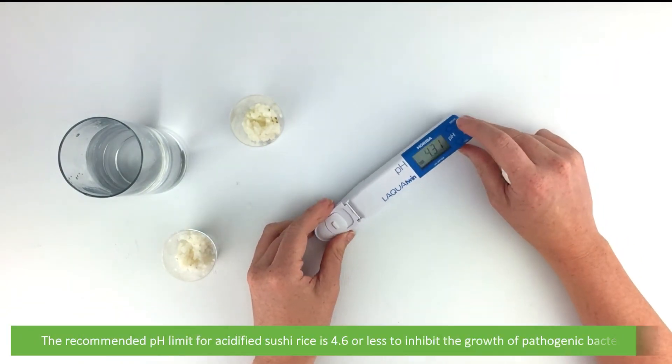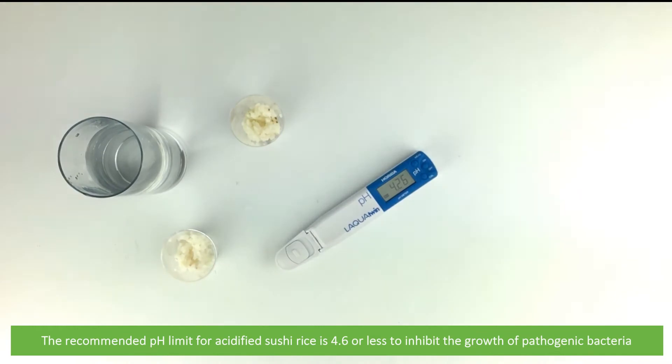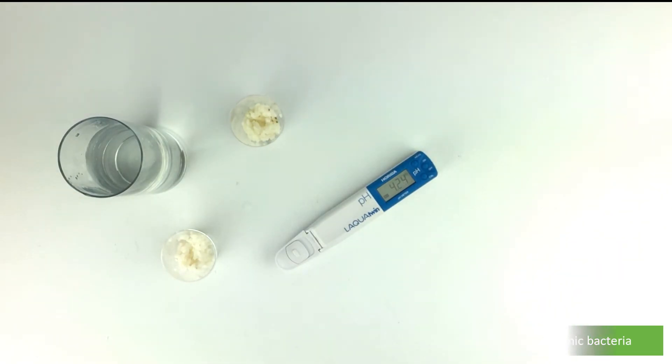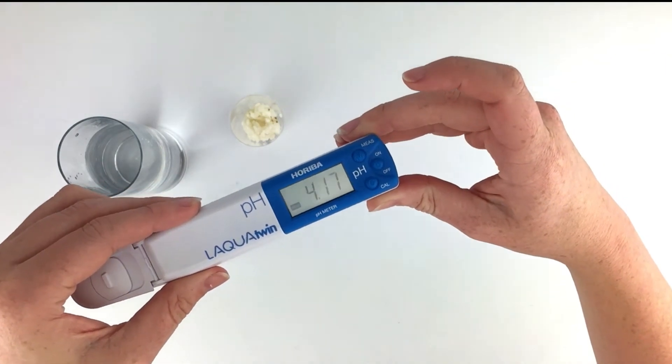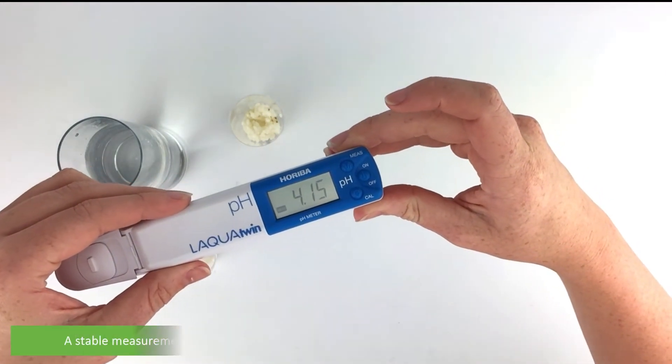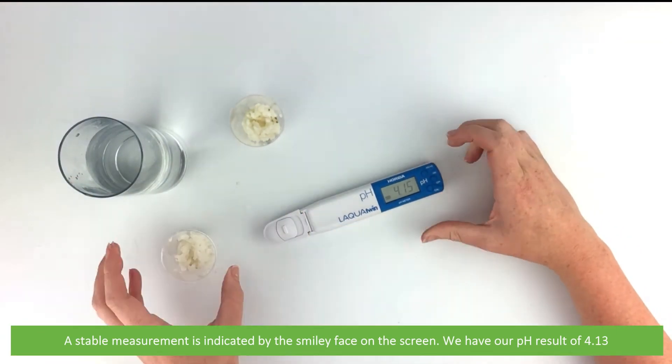The recommended pH limit for acidified sushi rice is 4.6 or less. This is to inhibit the growth of pathogenic bacteria. A stable measurement is indicated by the smiley face on the screen. We have a pH result of 4.13.